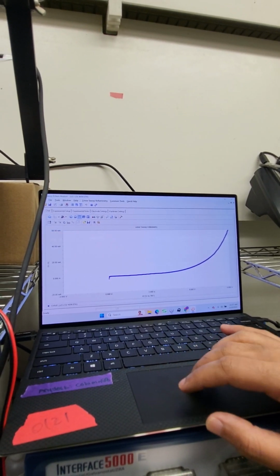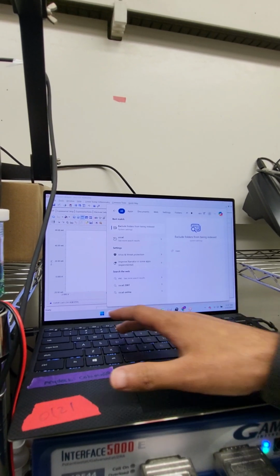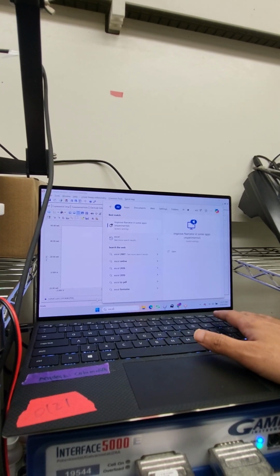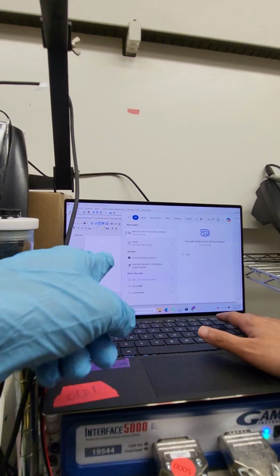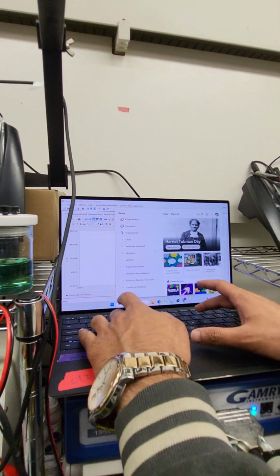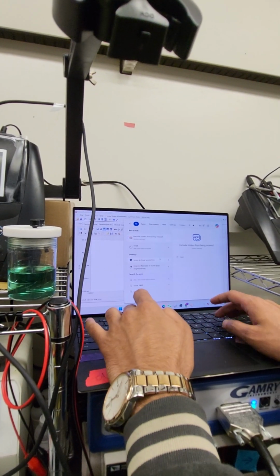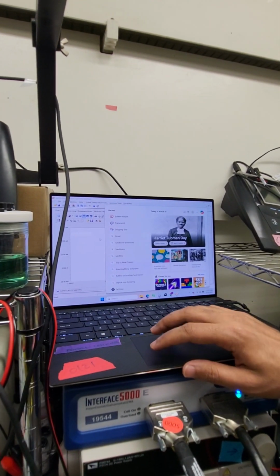copy this as text, into Excel. Where is Excel? You don't have Excel? I'm not sure. Maybe after that, I'll send you the data so that you can just analyze it directly. Yes, or you can send me the files. Yeah, just the data.